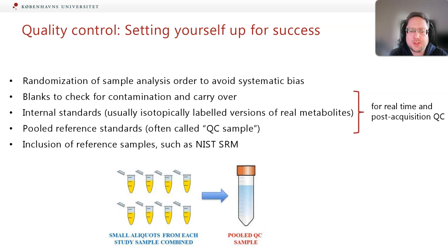You can use internal standards that can be somewhat helpful to understand the quality of your data, as well as maybe do something about it afterwards. But even more important is that you also inject so-called QC samples. They should be injected regularly during the analysis of the samples. By QC samples, I here mean ideally a pool of all the samples in the study, or it could be a reference sample that you use in all your studies.